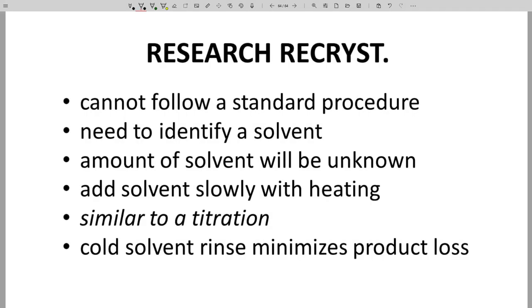While recrystallizing NBS is a great demonstration, during research, you often make molecules that are unknown. You won't know the ideal recrystallization method. You won't know which solvent to use. Ideally, you want a solvent that gives high solubility at high temperature, low solubility at low temperature. Choosing a solvent requires experimentation, but solvents like ethanol, acetonitrile, and acetone are very common choices.